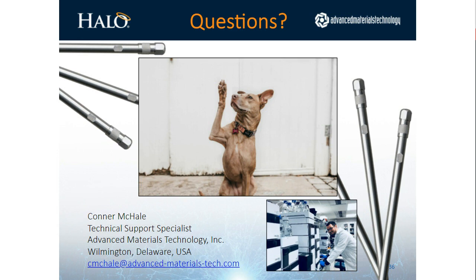Question from someone else with a sort of interesting circumstance. They say, I'm at a community college and our HPLC is not used regularly. Is there a standard maintenance schedule or protocol that you would recommend? Yeah, it looks like that's from Delaware Community College. So Advanced Materials Technology is actually in Wilmington, Delaware.